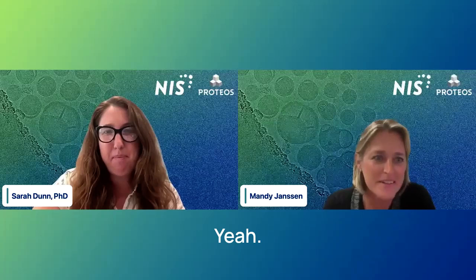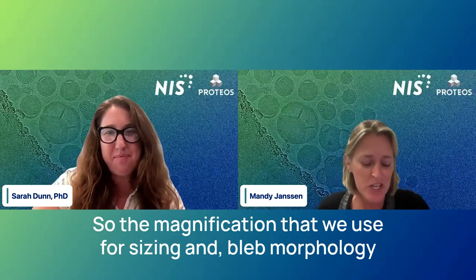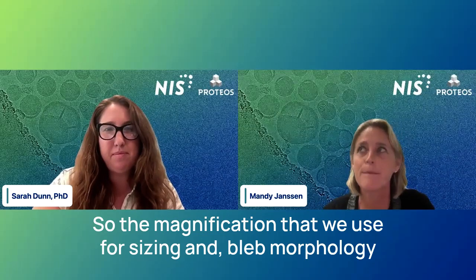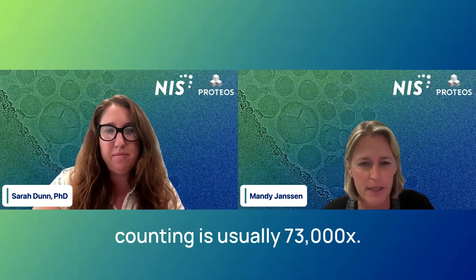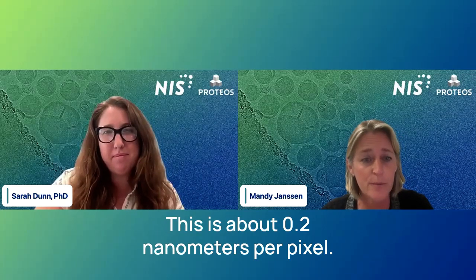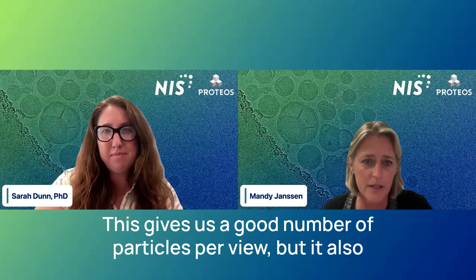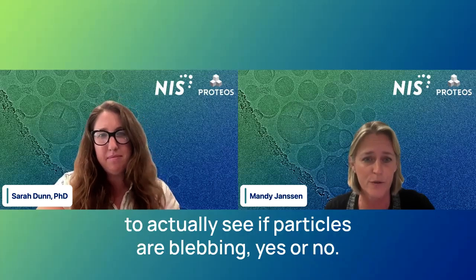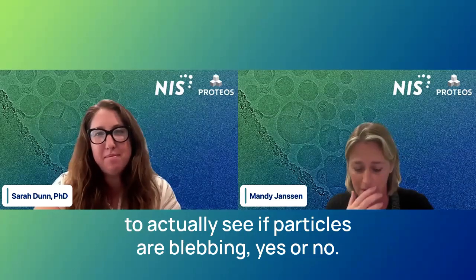All right. Yeah, thank you. Very good questions. So the magnification that we use for sizing and bleb morphology counting is usually 73,000x. This is about 0.2 nanometers per pixel. This gives us a good number of particles per view, but it also gives us enough contrast or enough details of the particles to actually see if particles are blebbing, yes or no.